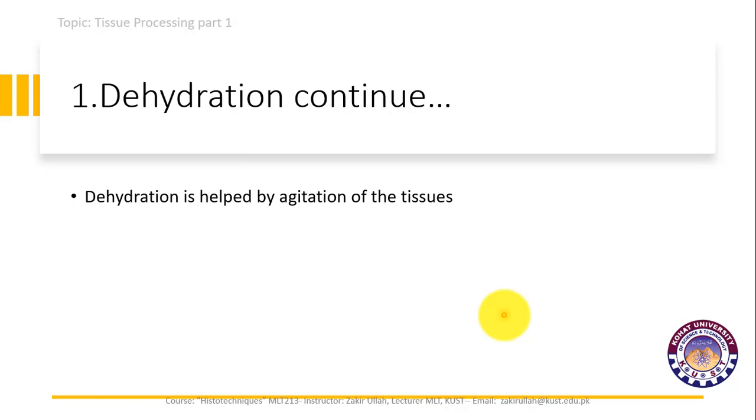As we discussed in the previous lecture, the process of tissue fixation is affected by agitation. So, to help and foster dehydration, agitation of the tissue is performed, and if the agitation is not performed, then this processing may take more than 2 hours.